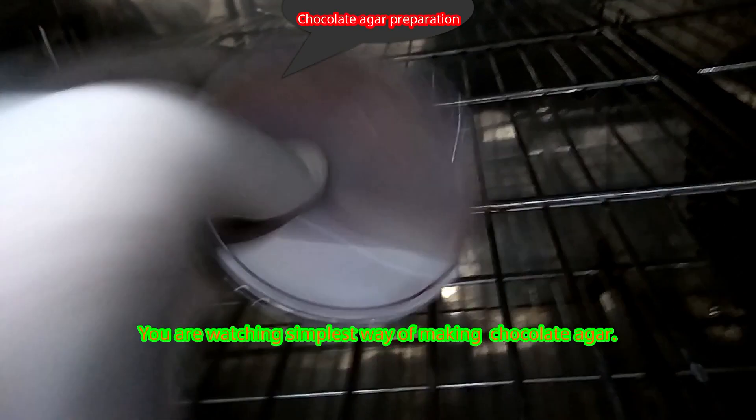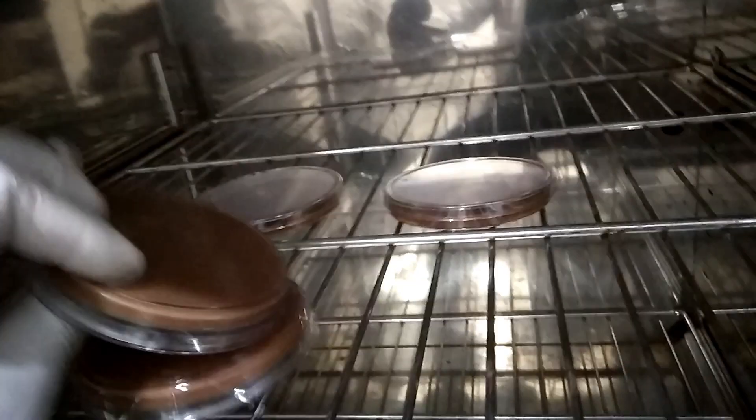In this way you can easily make or convert blood agar into chocolate agar.